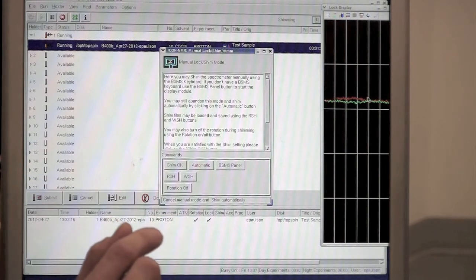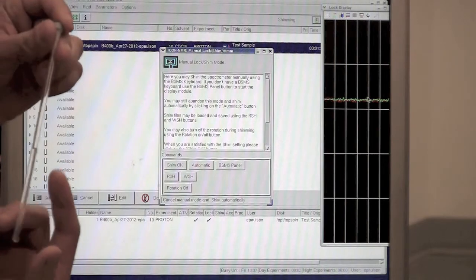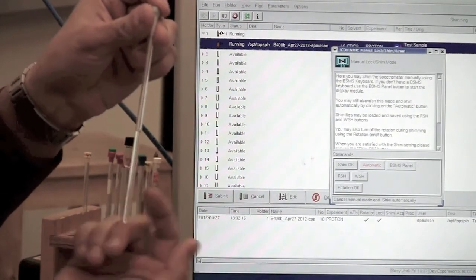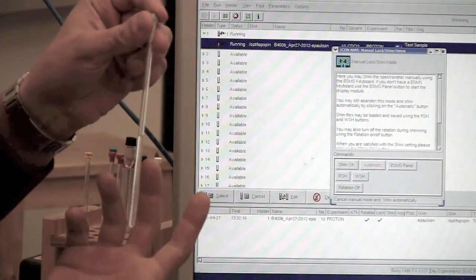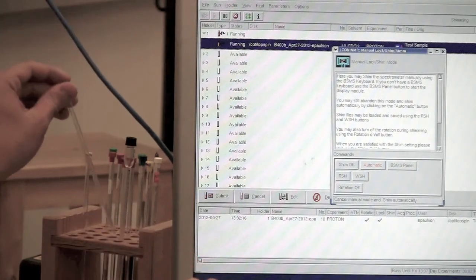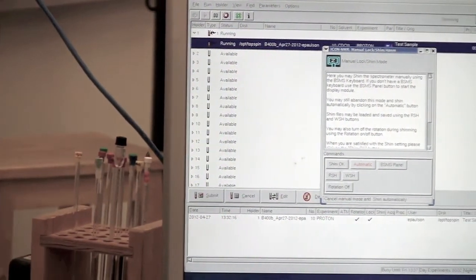But along the axis of the sample, we're not going to be able to predict what the field distortion is going to be, because the sample might be a slightly different height, might be a slightly different position, and the identity of the solvent might be different. All of those things will change how we need to compensate for its effect on the magnetic field, and that's going to be something we have to compensate on the instrument for each sample.